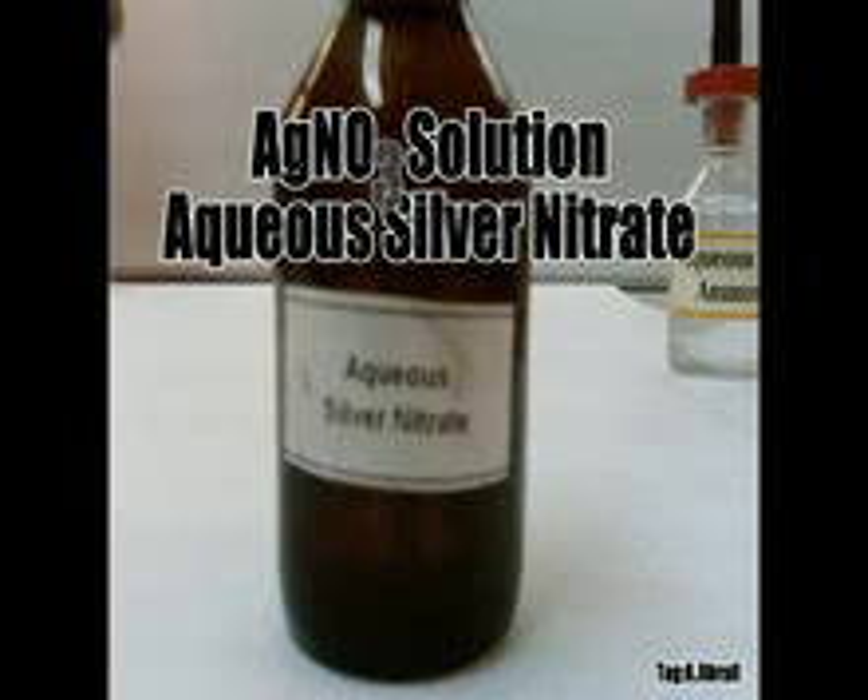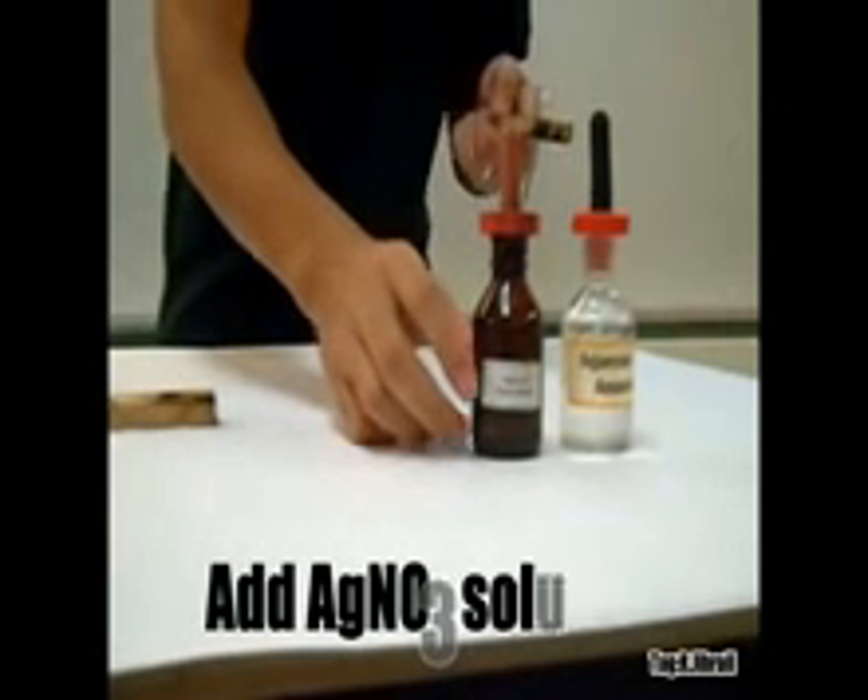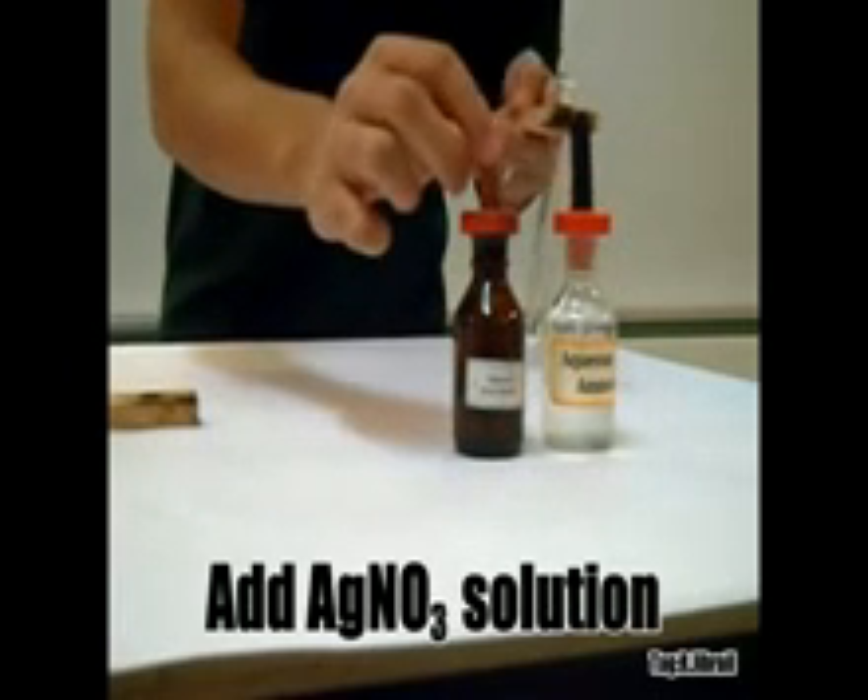This is the AgNO₃ solution of silver nitrate. Add the silver nitrate solution in the test tube.